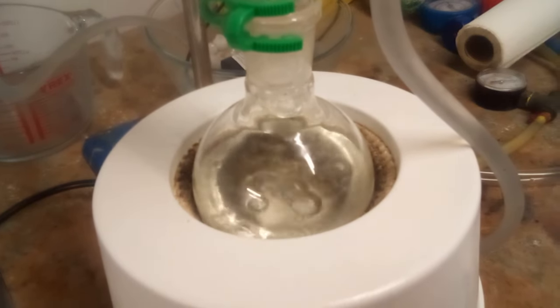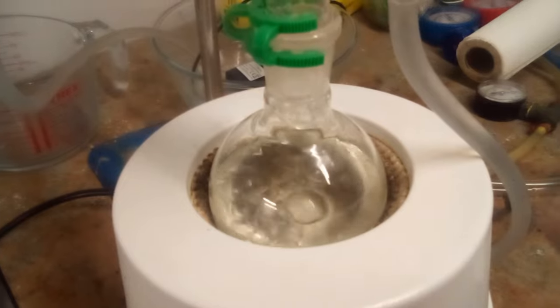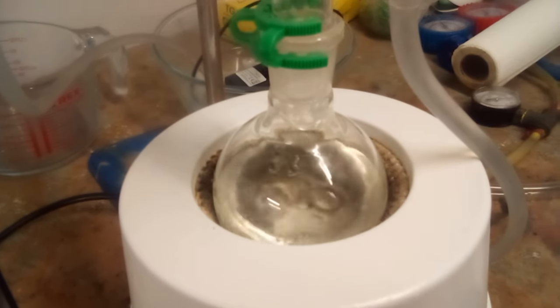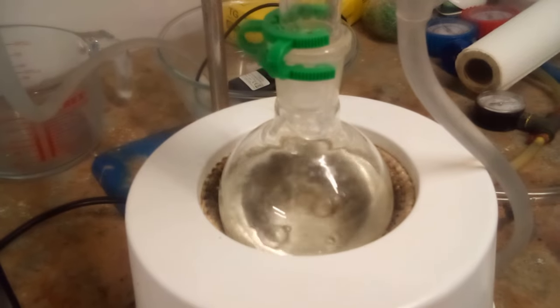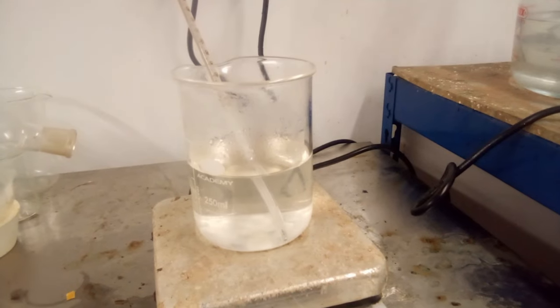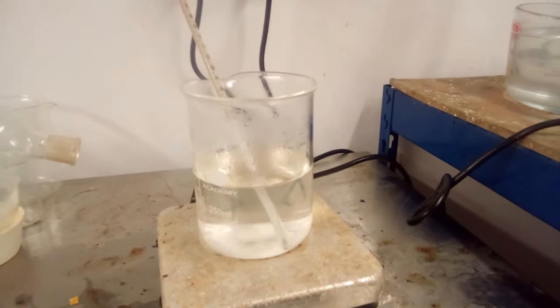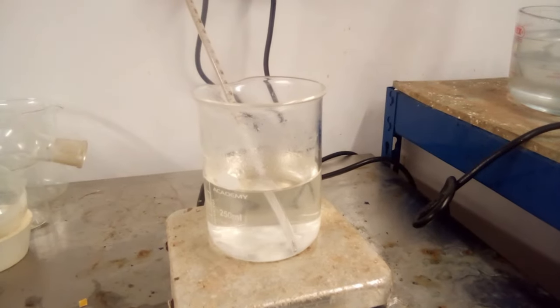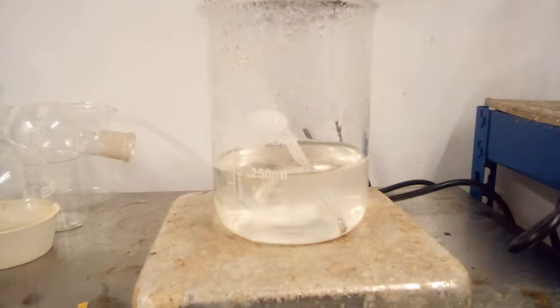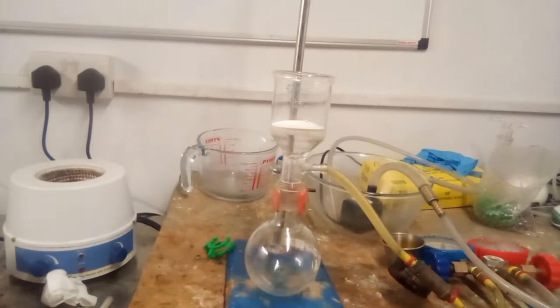The next step was to reflux this rather heat-unstable salt in water for 2 hours to hydrolyse it to sodium sulfate and hydroxylamine bisulfate. Brauer gives the reaction time as several hours without quantifying it, and I did this using 125ml of water. Once refluxing was complete the solution was boiled down over about an hour and a half. Being far less soluble than hydroxylamine bisulfate, sodium sulfate precipitated out first. The mixture was cooled to fridge temperature and the precipitate was collected on the pump.